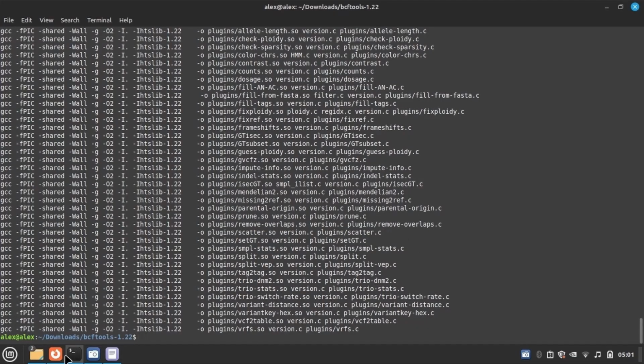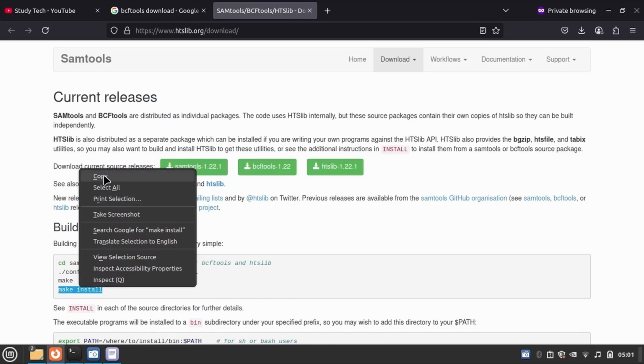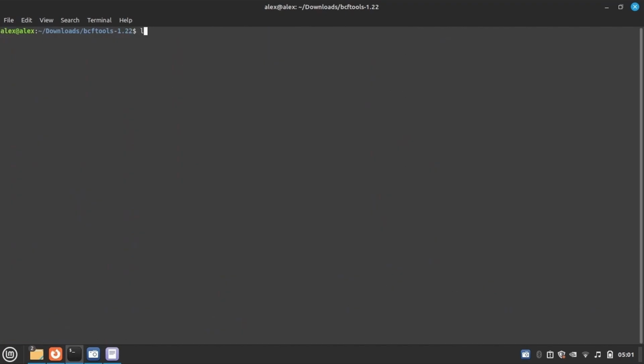Okay, so the next is make install. Enter. So I guess installation is done. Let's clear it.